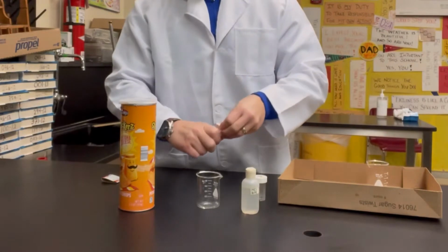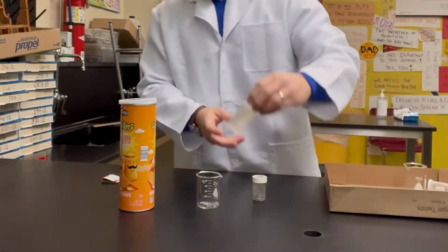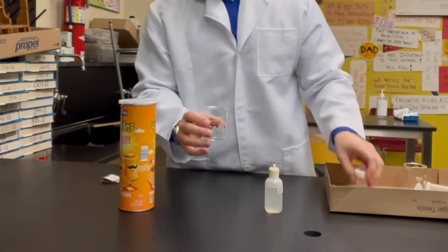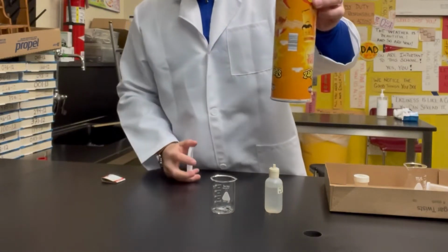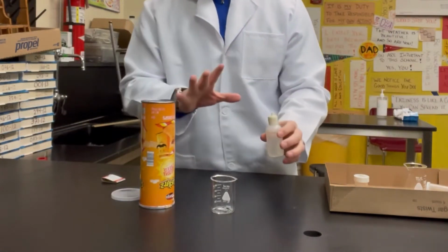So when I take pure zinc, I'm going to put it in a beaker, and I mix it with hydrochloric acid. There's going to be a single replacement reaction where zinc is going to come in and kick out hydrogen. Hydrogen is then going to form a gas. I am going to then trap that gas in this chip can. All right, so let's do that and see.